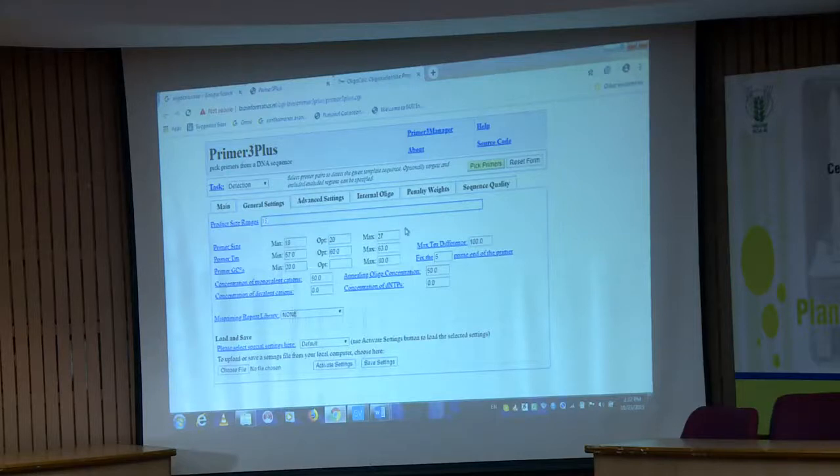Let us suppose I will put around 500 to 600 bases, right. So, you specify that. The rest, if you just see all the criteria which we have discussed, it is already highlighting and taking care of all those things. It is telling you that minimum should be this, maximum should be this, but the optimum should be this. Once you specify the size of your PCR amplicon, then you can say, okay, pick primers.